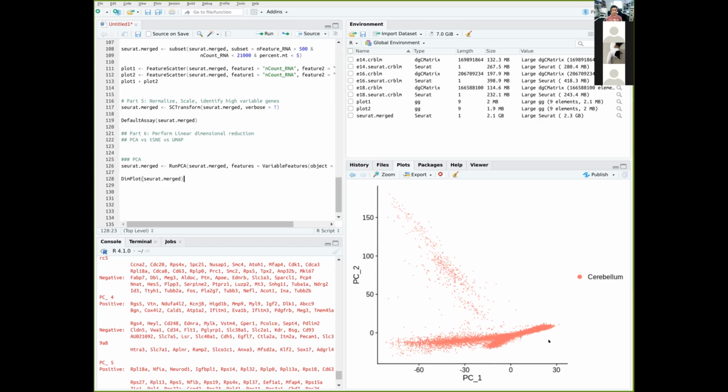They are not separated well enough. It's difficult to figure out how many cells are in this cluster and what their identities are, because they are so close that they are almost overlapping. They're not overlapping; each cell has its own coordinate, but they are so close that it's difficult to tease apart the cells.